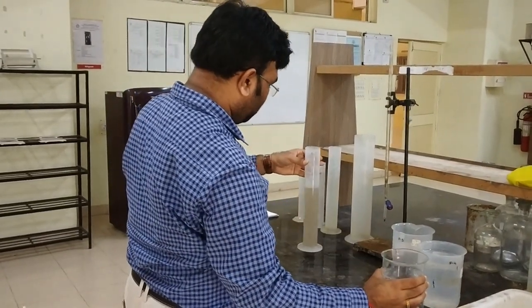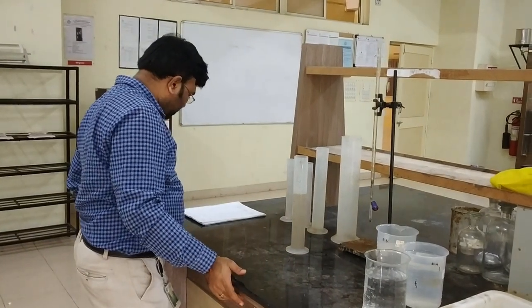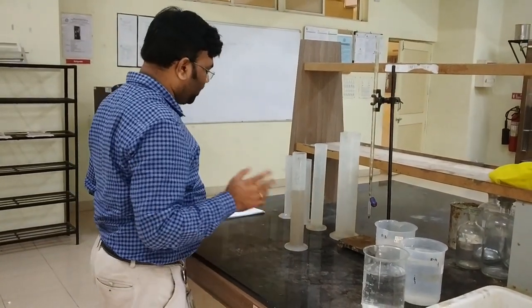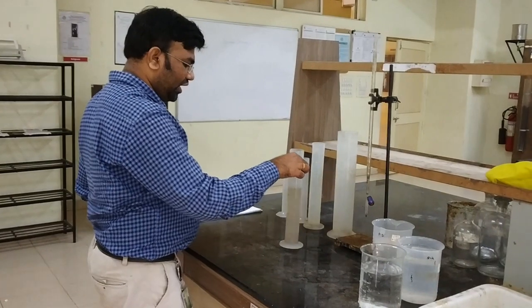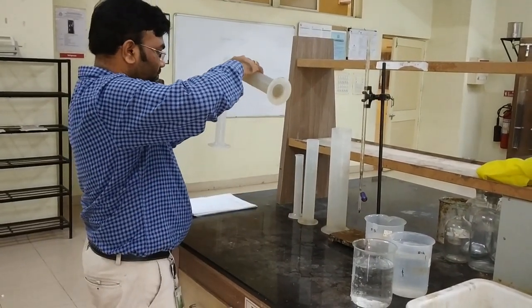We have diluted it to 250 ml. The next step given in the table is to extract 25 ml from this diluted sample. So we are going to extract 25 ml.